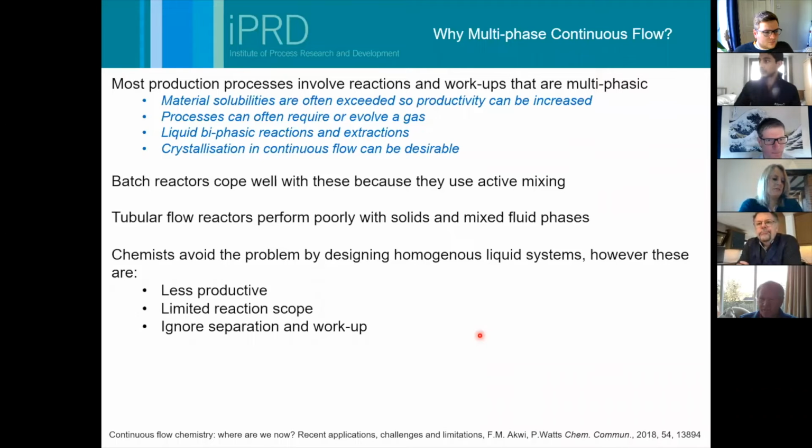Processes can often require or evolve a gas, and so again we can end up with multi-phase systems. We might want to do liquid-liquid reactions with 2 liquids in there, for example, during workup and extraction, things like that. Or we might want to do crystallization, where we generate crystals in flow as well.